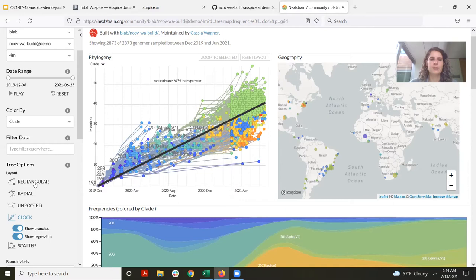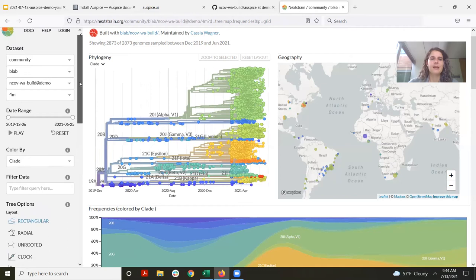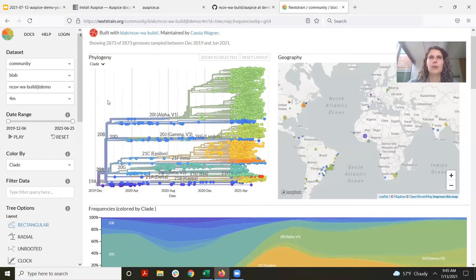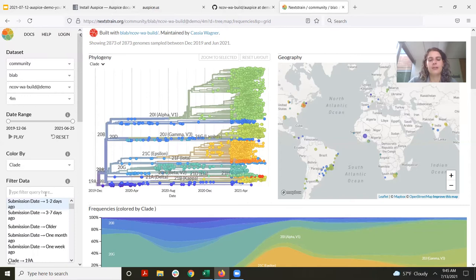This is a Washington state-focused tree, built to explore and keep track of what's going on with SARS-CoV-2 in the state of Washington. When we constructed the tree, we put a lot of thought into deciding what non-Washington sequences to include so we can appropriately construct introductions into the state. But when I'm exploring it, a lot of those sequences are not what I want to look at. So the first thing I'll do is filter out sequences that are not from Washington.